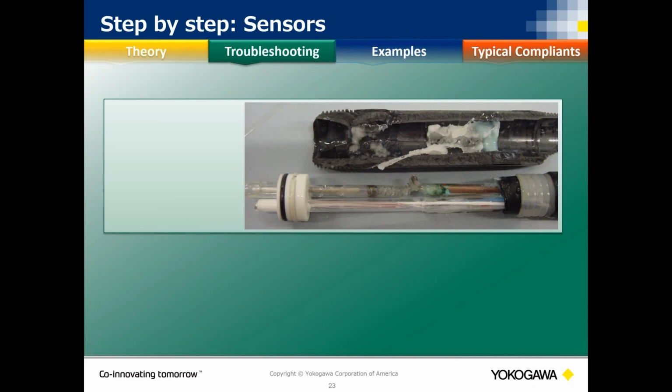Here's another one that we need to look at, which is just the inspection of the sensors itself. Sometimes you're going to get slow to respond, and we're going to have to look at what actually happened to the process, because a lot of times we hear, well, these were working just fine and now it's not working, the cable's fine, I changed the cable, I changed the sensor. But then when we go to change the sensor, that's when we see the visible damage to the probe.